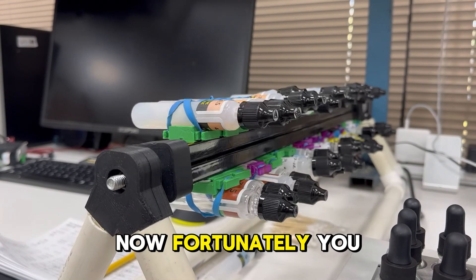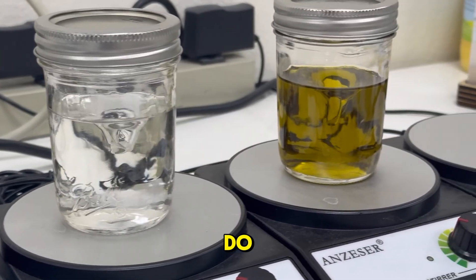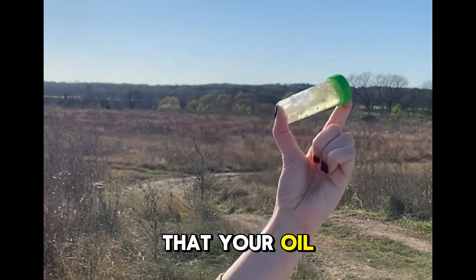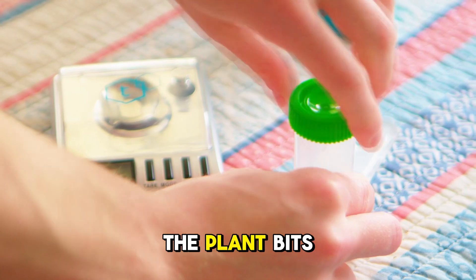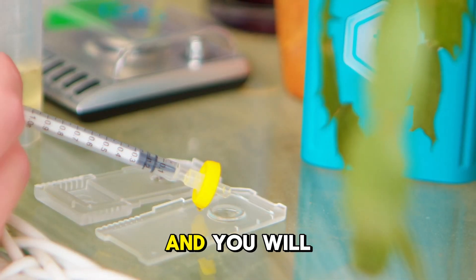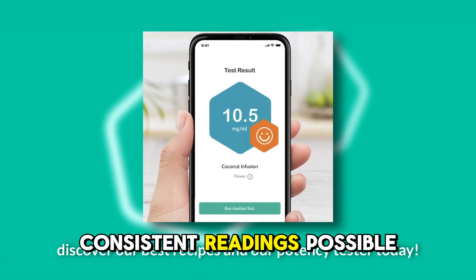Fortunately, you don't have to go through the extremes that we do. Just make sure that your oil is mixed really well, then don't forget to filter out the plant bits, and you will get the most consistent readings possible.